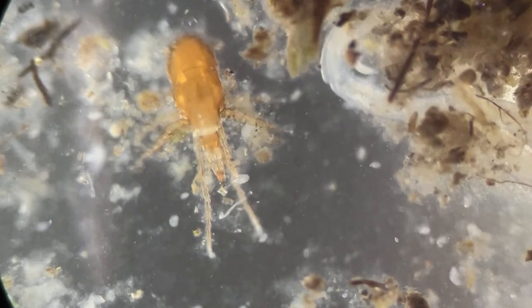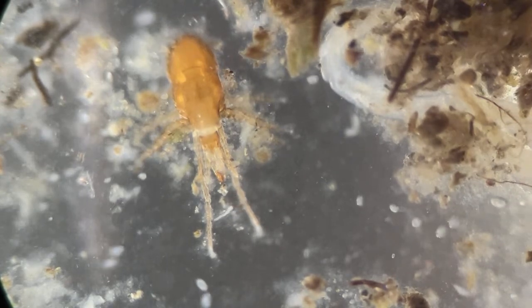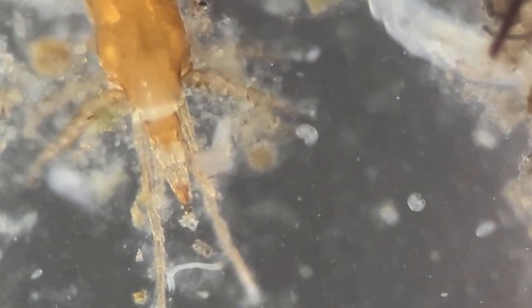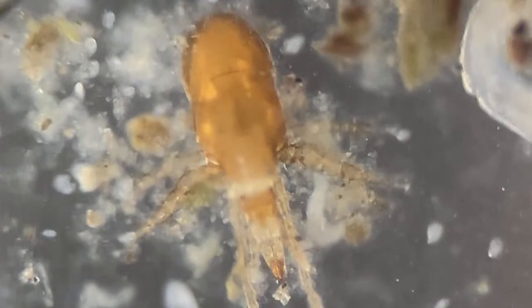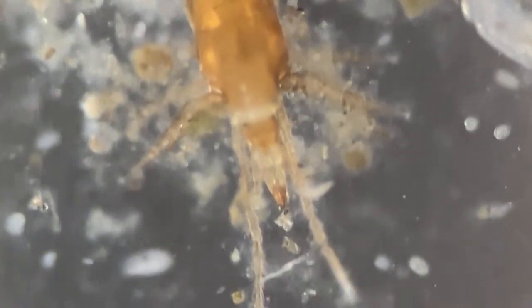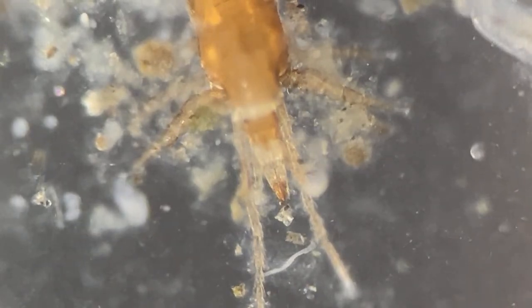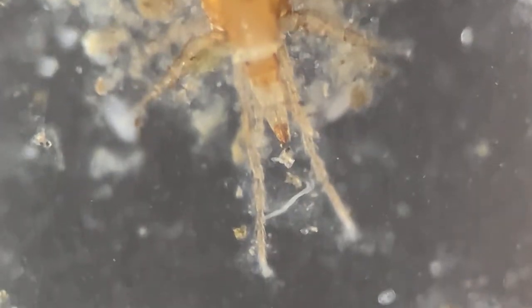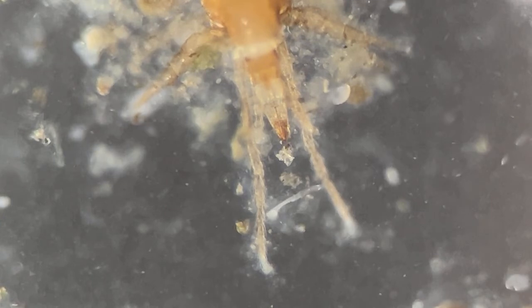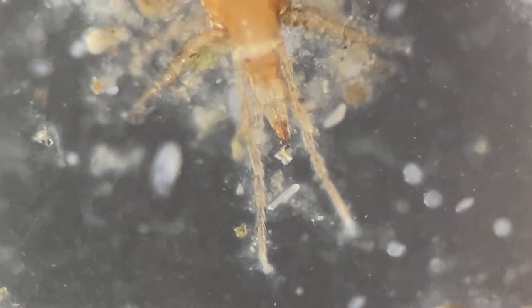Now, I believe you will agree with me when I say that the structural patterns on this tick are much better defined in this view than the piercing light view. Even the worm that we have, a small one here between its tentacles, is also more realistic.